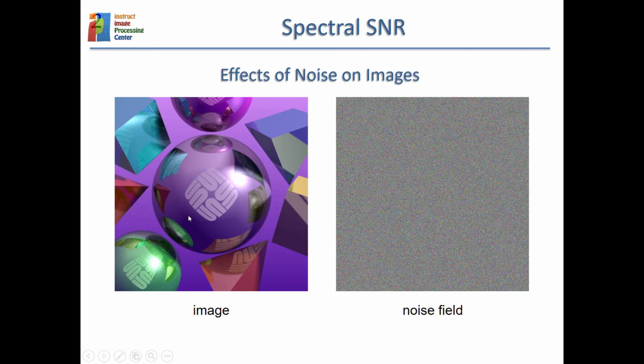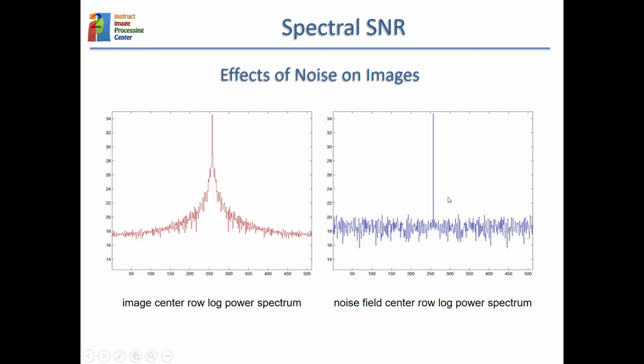Here you have this idea. Let's say that you have a perfect image. This is a simulated example. We have a perfect image, we have noise, and if we analyze the Fourier transform of those, taking just a profile through those power spectra, we would see that the power spectrum of the signal is very much concentrated around the zero frequency, so around the low frequency components, while the amplitude that we require for reproducing noise is more or less spread all over the place.